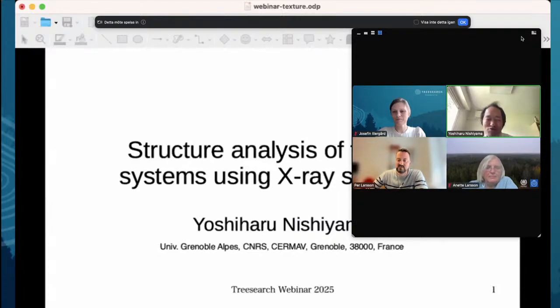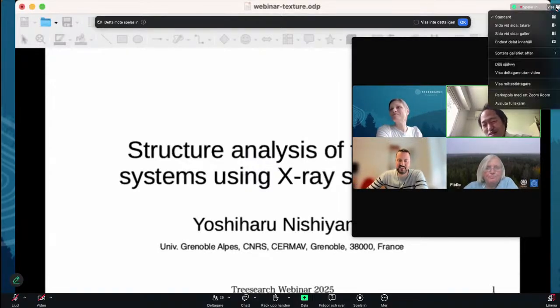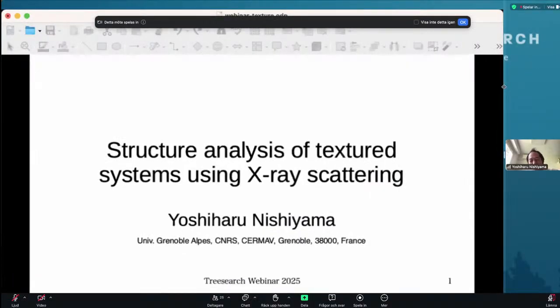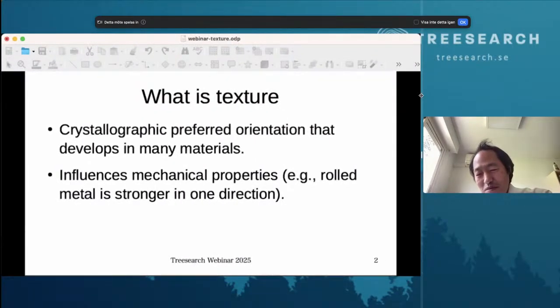Thank you very much. So the title for today's presentation is Structure Analysis of Textured System. So Per, do you understand when I say textured system, do you understand what I mean? I mean, when I asked ChatGPT what just "textured" means, it gives all kinds of definitions that I didn't mean. And here, when textured is combined with X-ray, ChatGPT can answer relatively well what I mean. And what I mean by textured is that you have some crystallographic preferred orientation in a material.